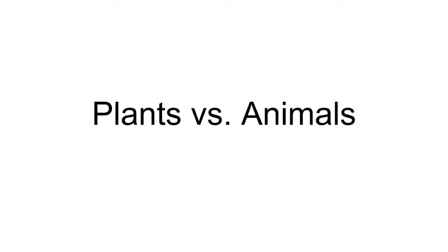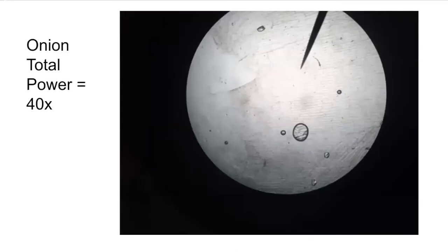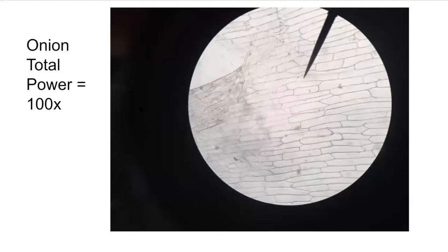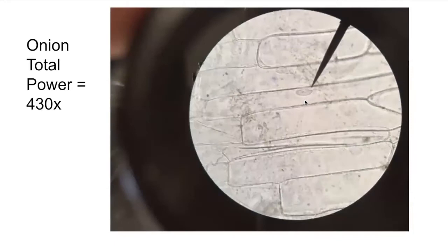Now that we've focused on these different plant and animal cells, let's talk about what we were able to see. This is our onion on low power — we can see the matrix of cells made up of little blocks that look like a brick wall. As we increase magnification to 100 times, the cells are clearer and we start seeing the nuclei. At 430 times magnification, we can see the nucleus very well, the cell wall, the space between cells, and the cytoplasm — the inner material that makes up the inside of a cell.